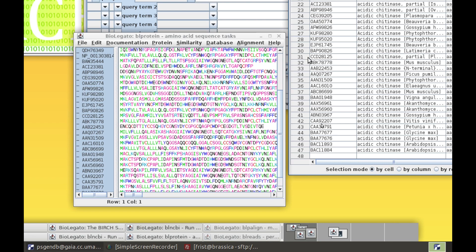Since we're retrieving proteins, the proteins will pop up in BLProtein, a BioLegato application specifically for working with proteins.